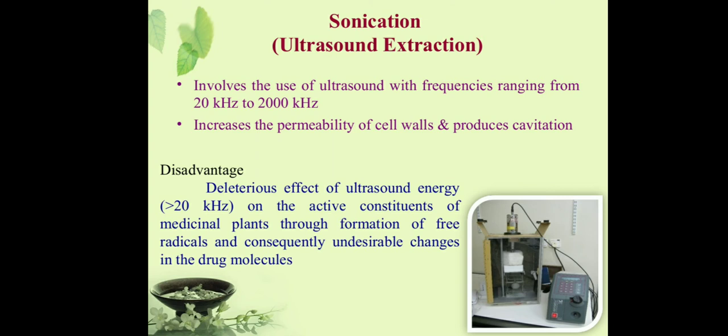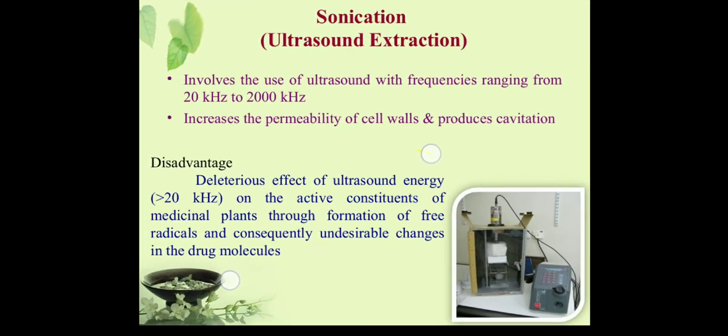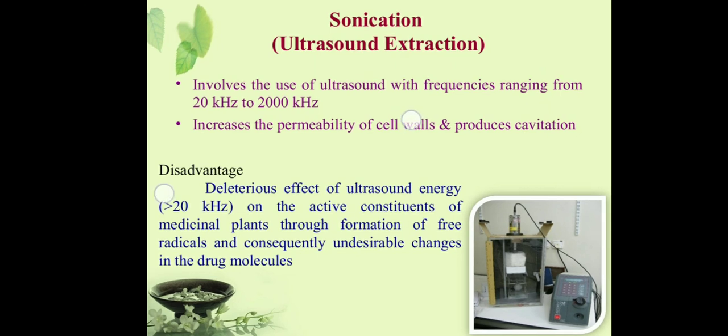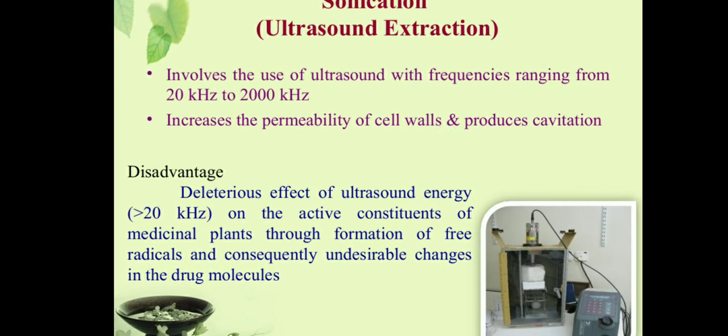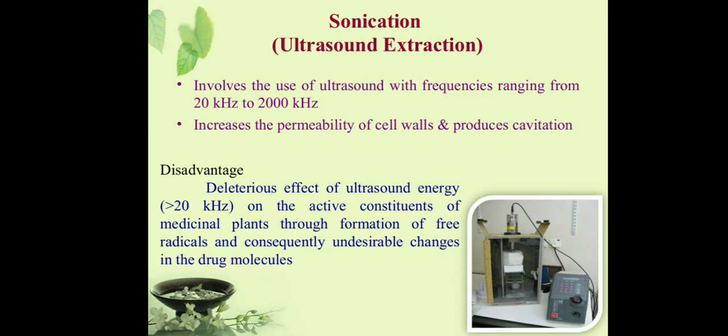The vessel is filled with the crude drug, and cavitation is produced in it. It is basically based on ultrasound waves of a special range. When we talk about the disadvantages, sound energy of more than 20 kilohertz can affect the constituents of medicinal plants through the formation of free radicals and cause undesirable changes in the drug molecules. When we use this kind of ultrasound, it creates free radicals that can be more dangerous for our body.